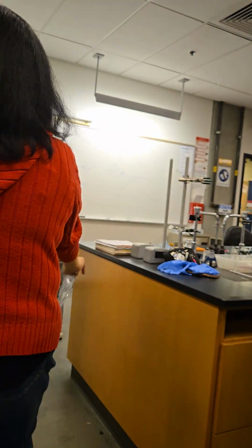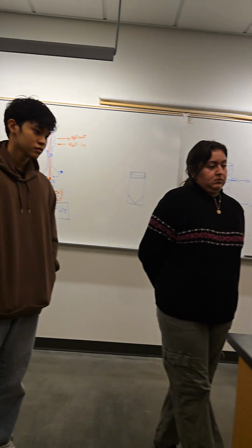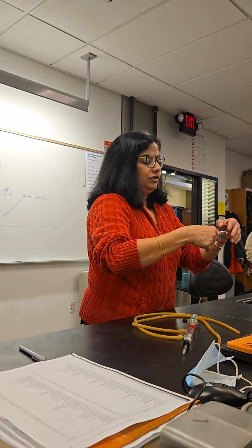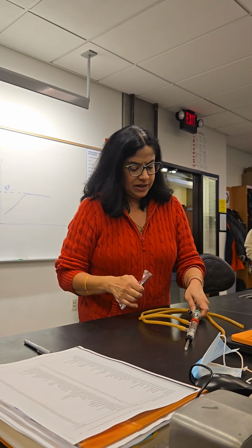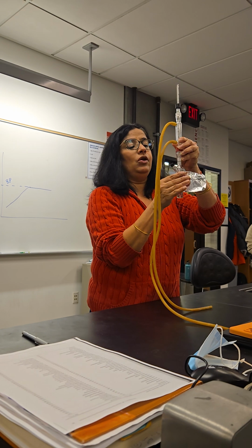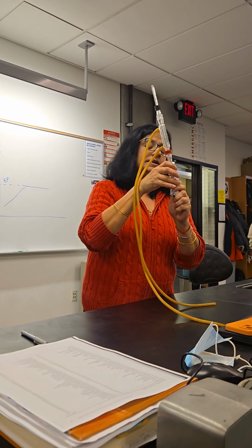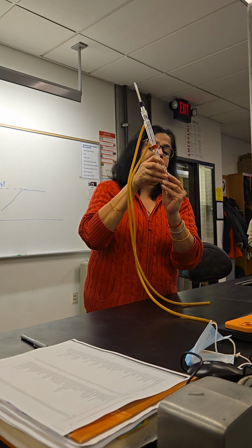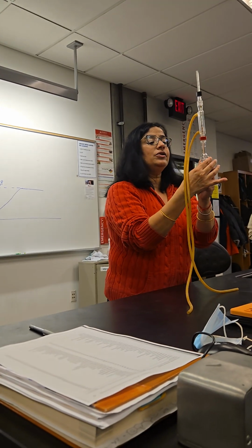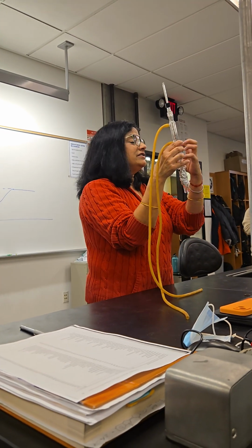In those cases, I would suggest getting a piece of aluminum foil. You saw where I got it from. You don't need a huge piece, just a small enough piece for this part of the apparatus right below the collection chamber, but above the sand bath. So assume that's covered in sand. Cover that part with the foil, so that it conserves the heat.